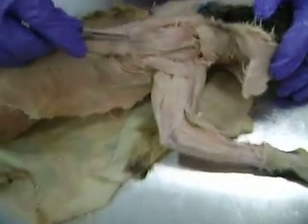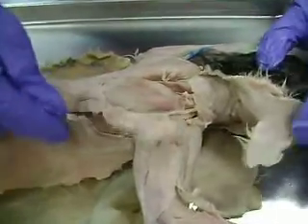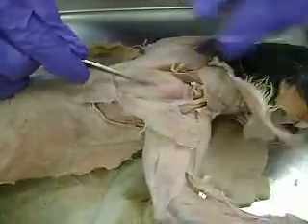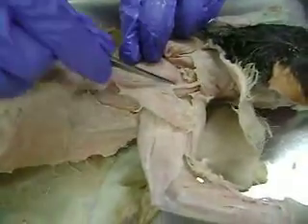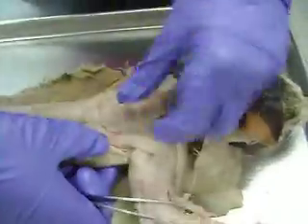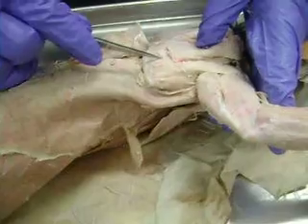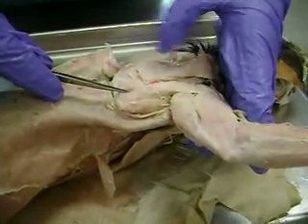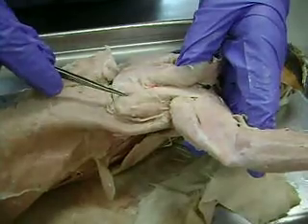If we look back, underneath the acromiotrapezius is the supraspinatus. You can kind of see the spine of the scapula going down here. So if we pull this out a little bit, you can see the side of the spine right here — this would be the infraspinatus. So supraspinatus, infraspinatus.